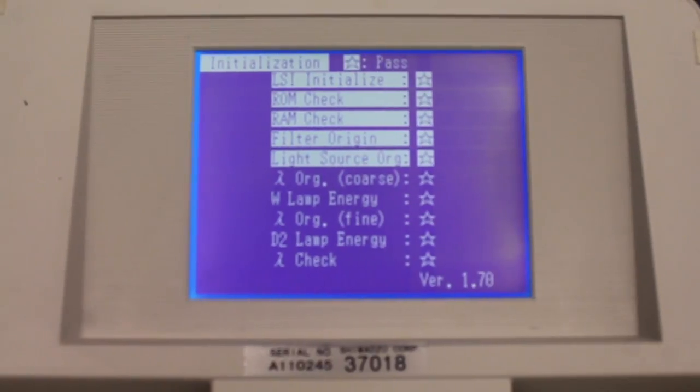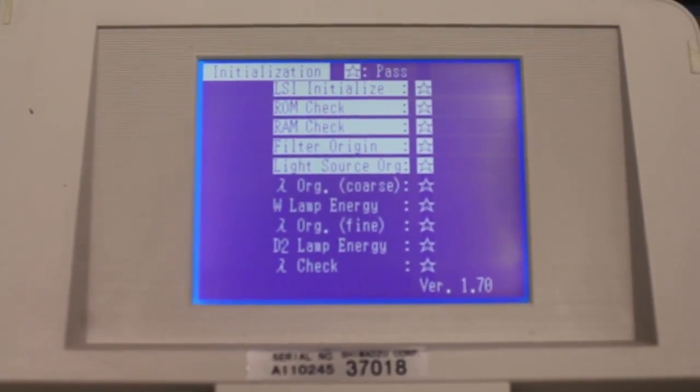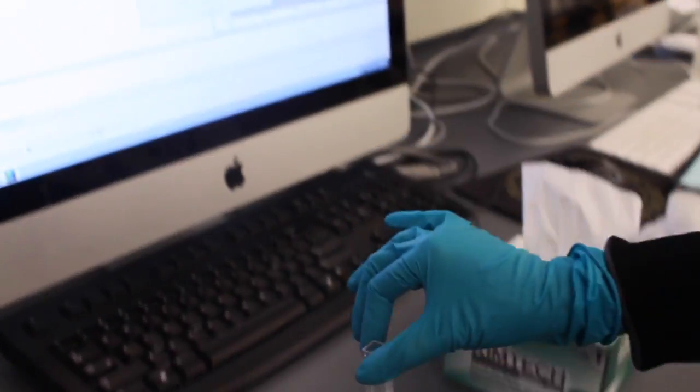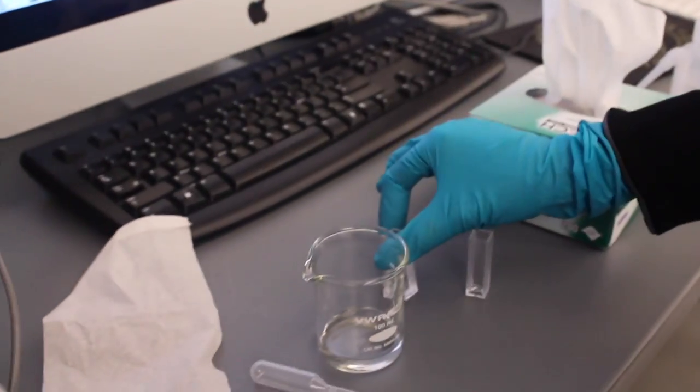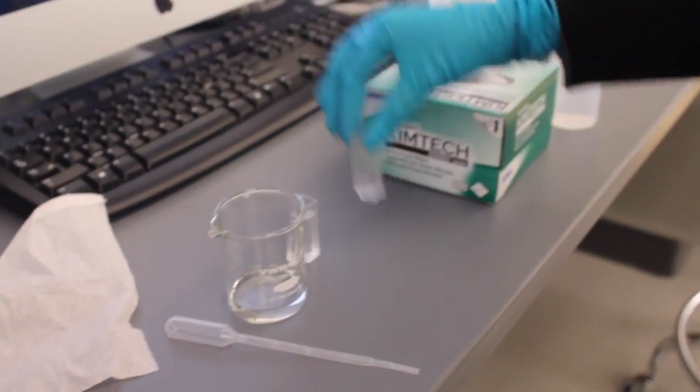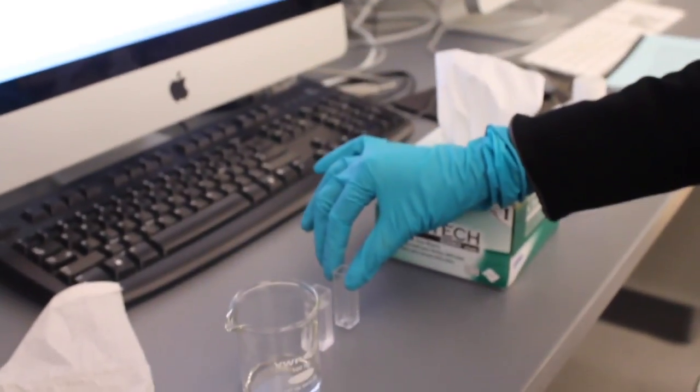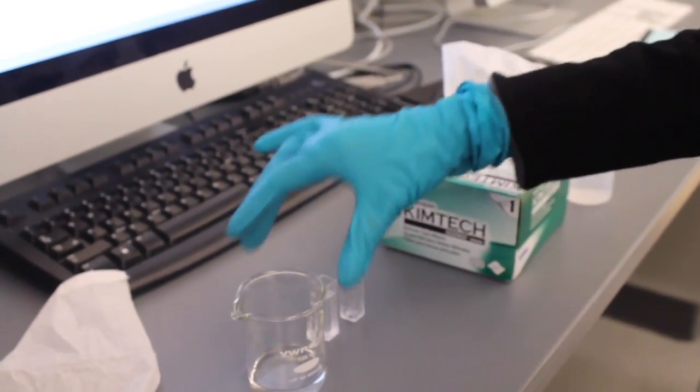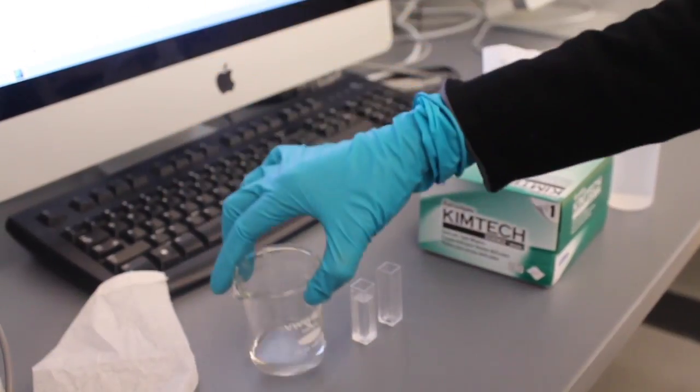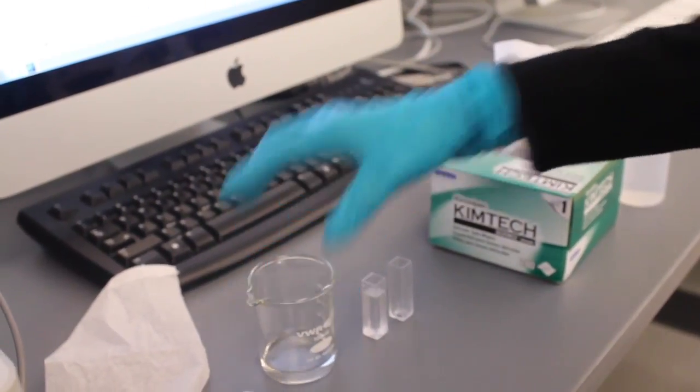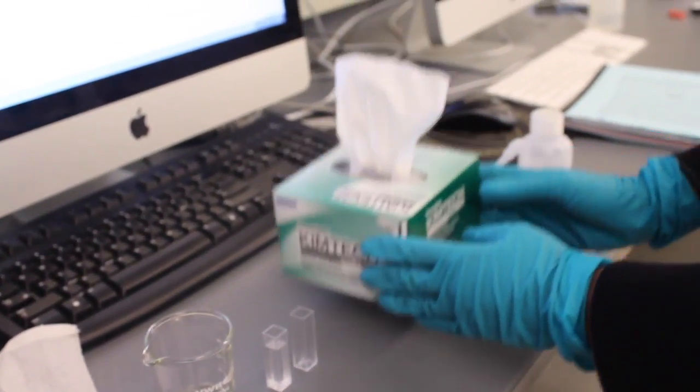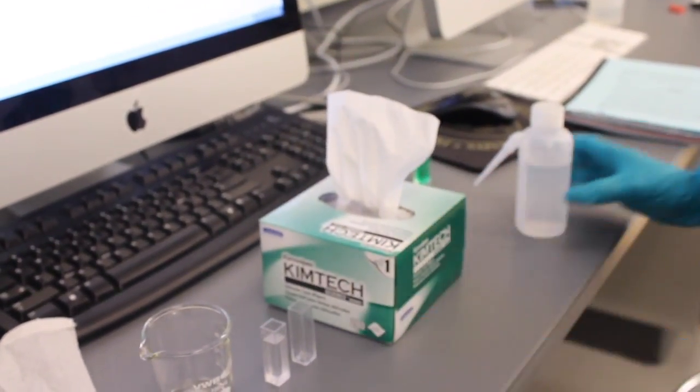In order to prepare to take a baseline, you will need 3 cuvettes, a waste beaker, kim wipes, and DI water.